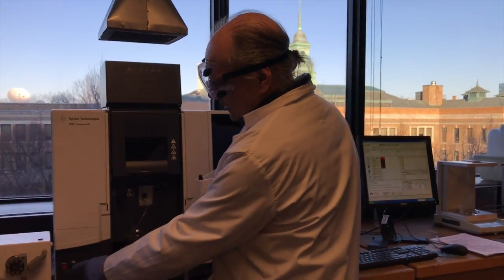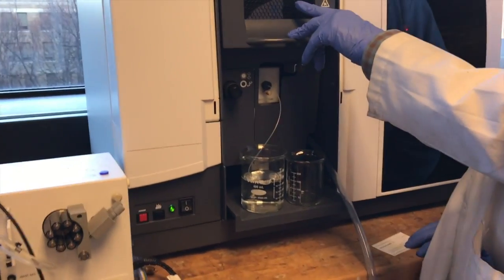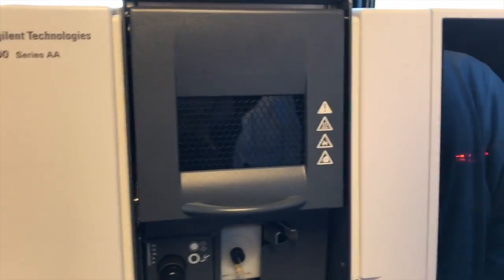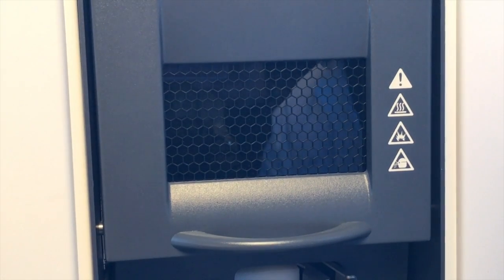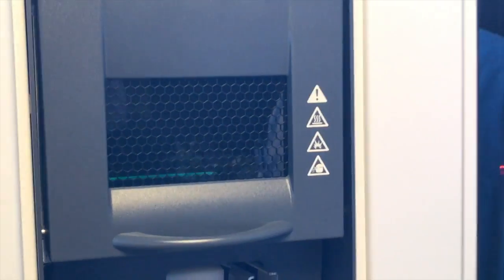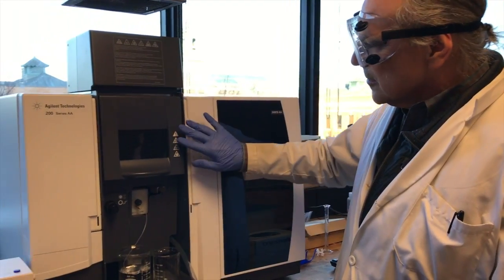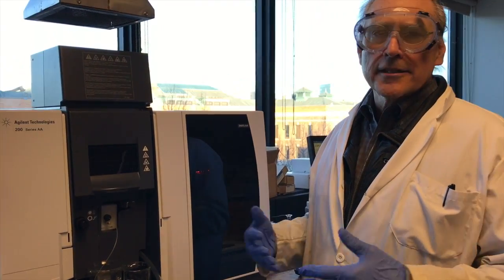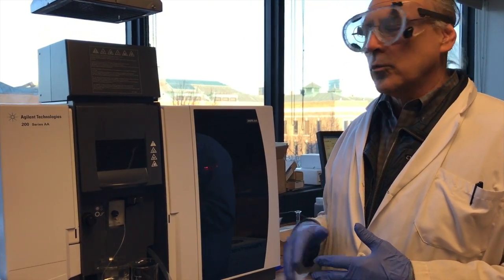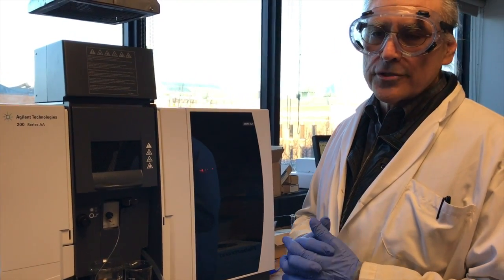There are two buttons — an easy way to do it. I'm going to press this button and hold it down. I had to hold it down and now it's lit. I don't want to lift this up because if I do it'll shut the machine down. This has to warm up — it takes about five to ten minutes to come to equilibrium. We'll wait for that to happen and then go to the next part where we do the calibration and read the sample.